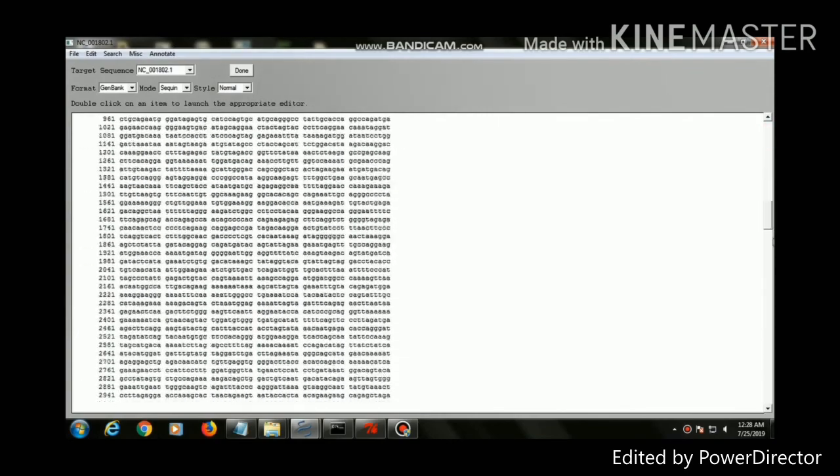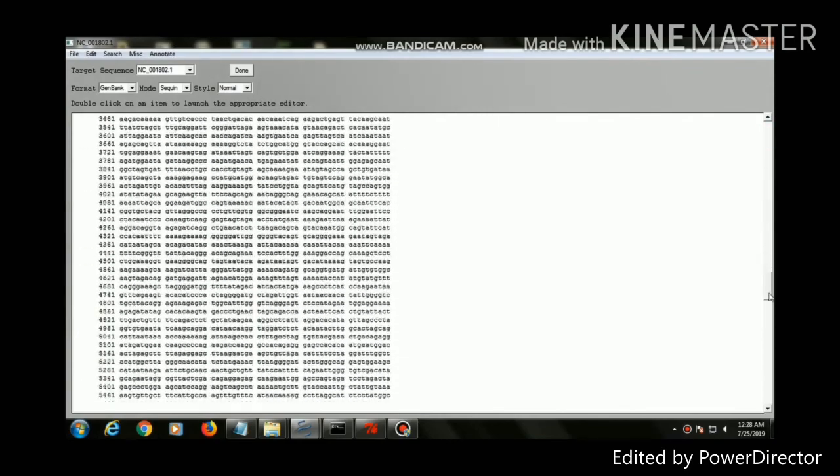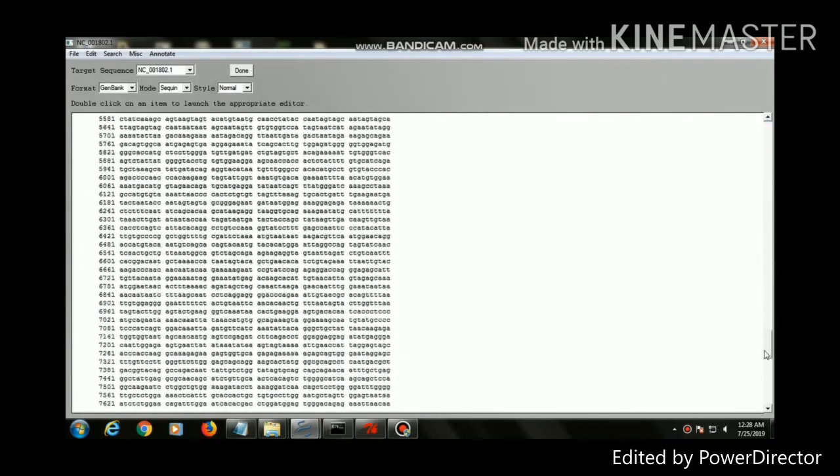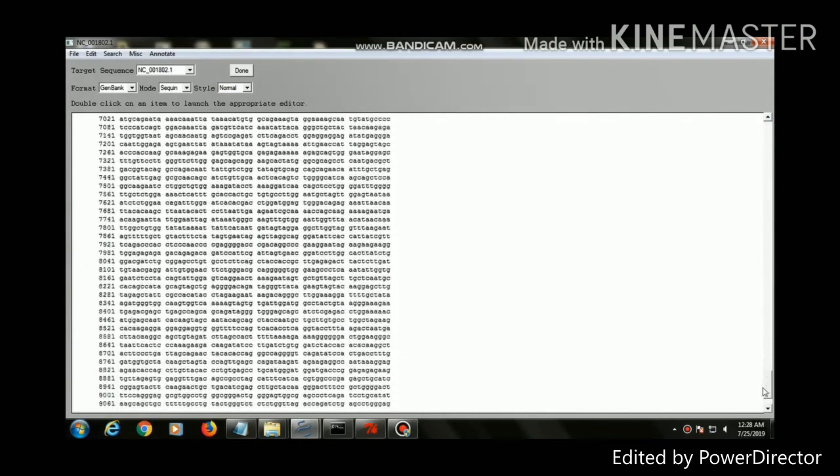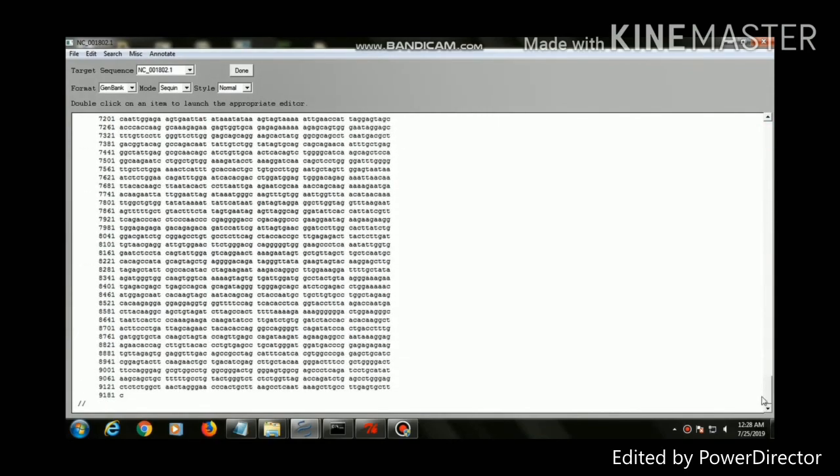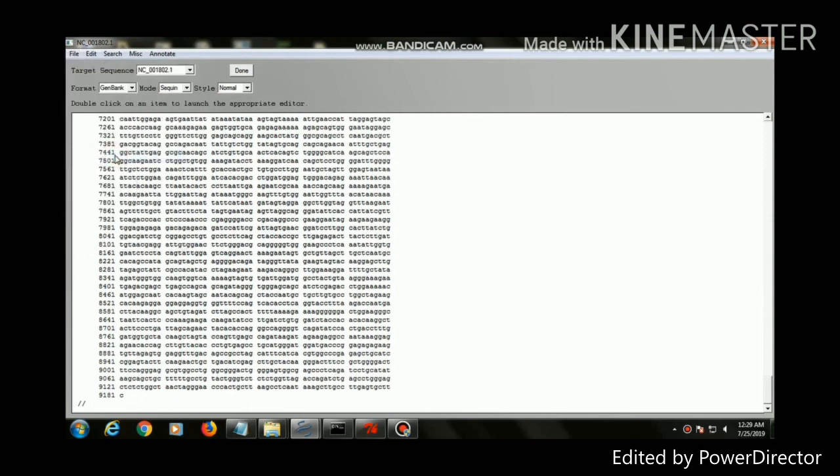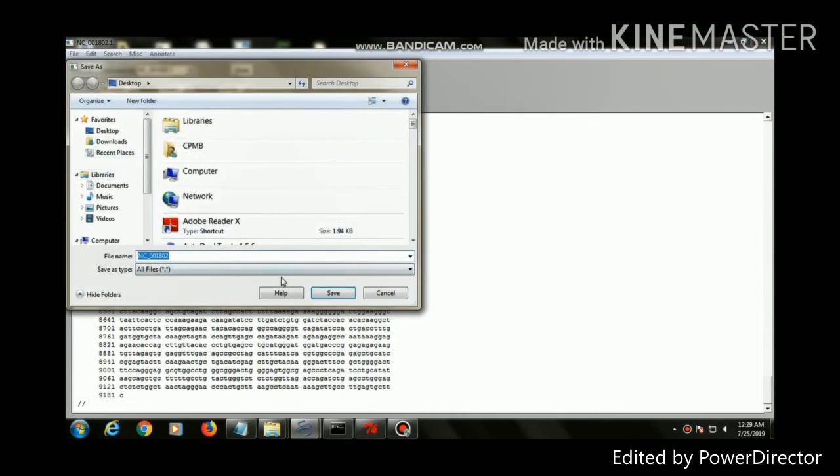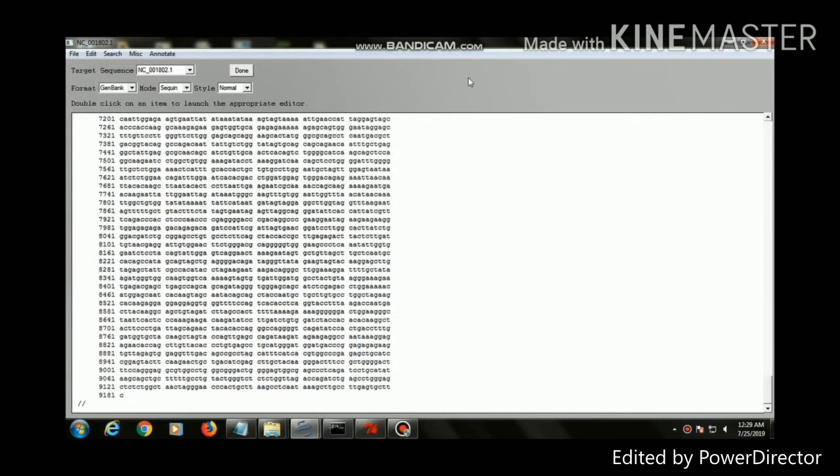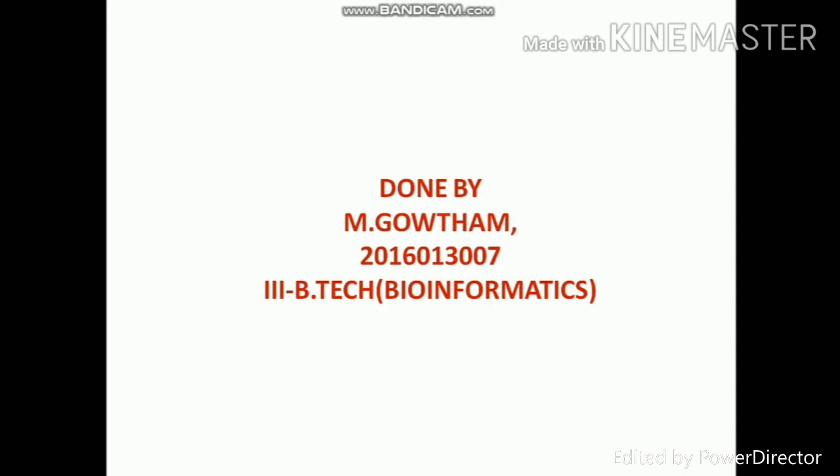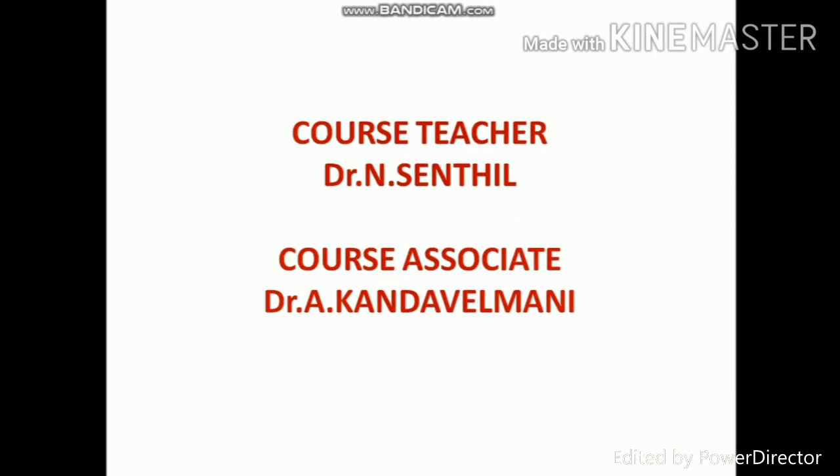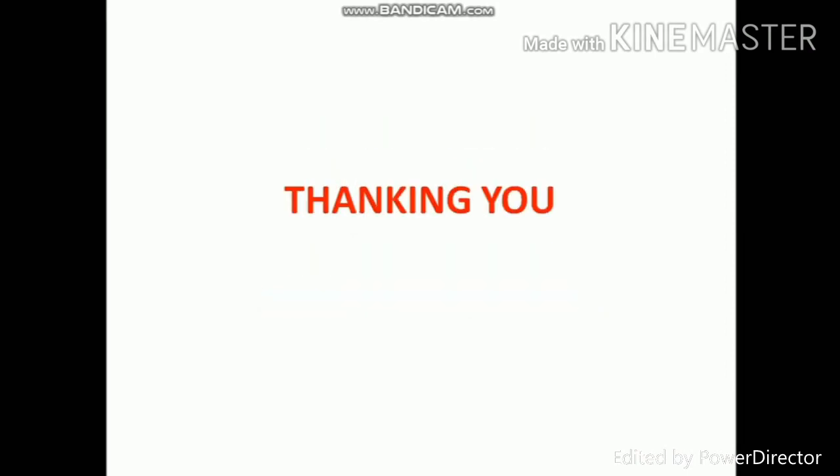Title, journals, comment, feature, then base count. Then it will show the alignment of the sequence. Then save the file as sequence format. The sequence file is submitted to the NCBI database.